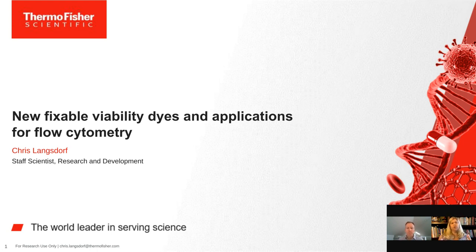What about fluorescent spillover in other channels in absence of a washing step for these new dyes? Yes, thanks for that also. I just will reiterate that it's surprising that we don't have to wash our cells after labeling with these dyes, and our standard protocol still does say to label your cells first with a live dead fixable viability dye and then wash, and then proceed to your antibody labeling and fixation steps.